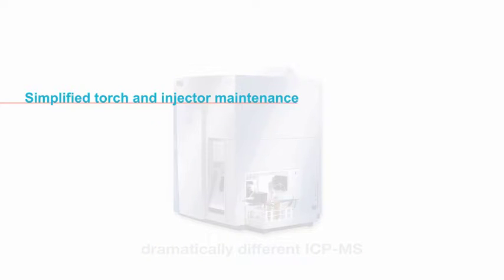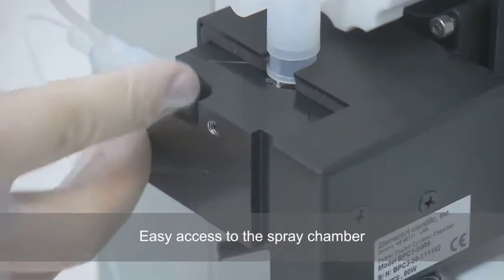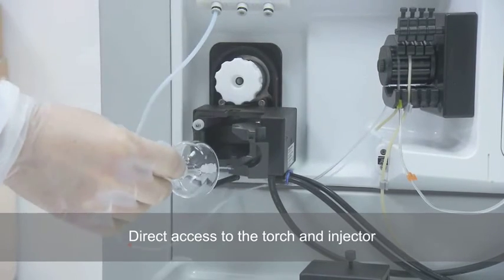Simplified torch and injector maintenance on the Thermo Scientific iCAP-Q ICP-MS. Tool-free removal of the Peltier casing provides easy access to the spray chamber. Simple removal of the push-fit spray chamber allows direct access to the torch and injector.